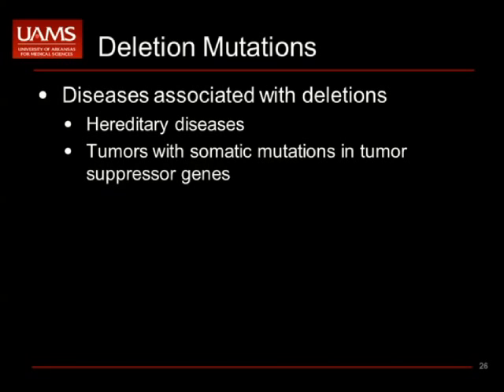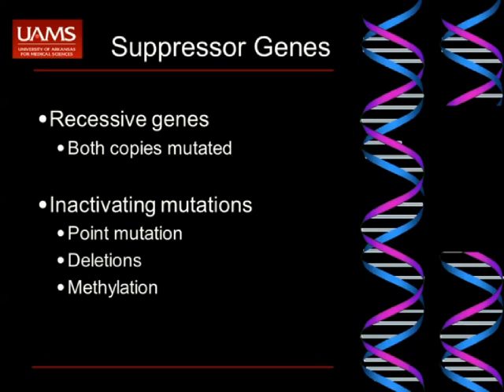Now, once the RNA is processed, the introns become spliced out, and 2 exons from 2 separate genes become put next to each other. PCR is possible across that by converting it to cDNA and then getting a product and doing polymerase chain reaction after that. So this is why we can use mRNA analysis or RT-PCR analysis to do the translocation analysis.